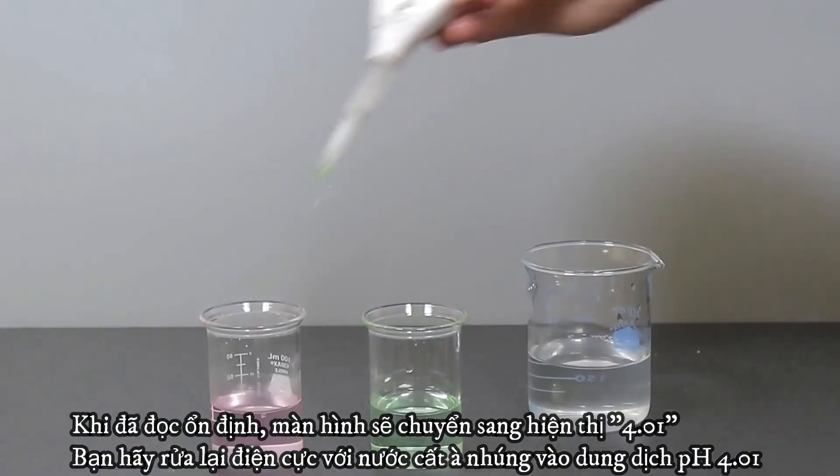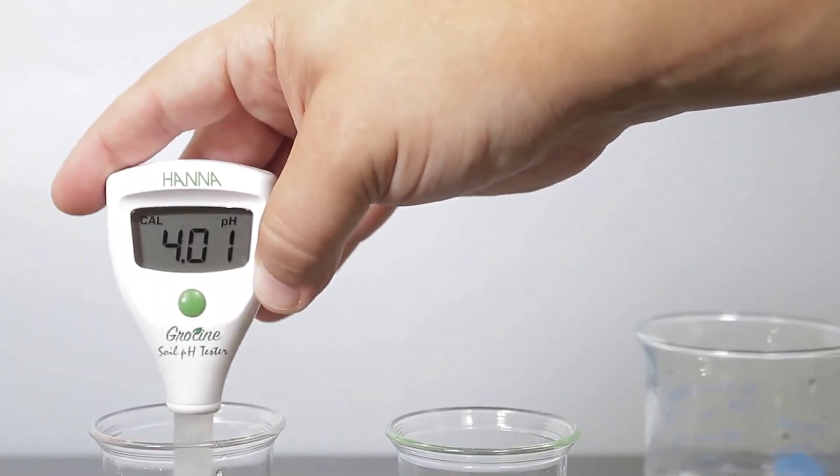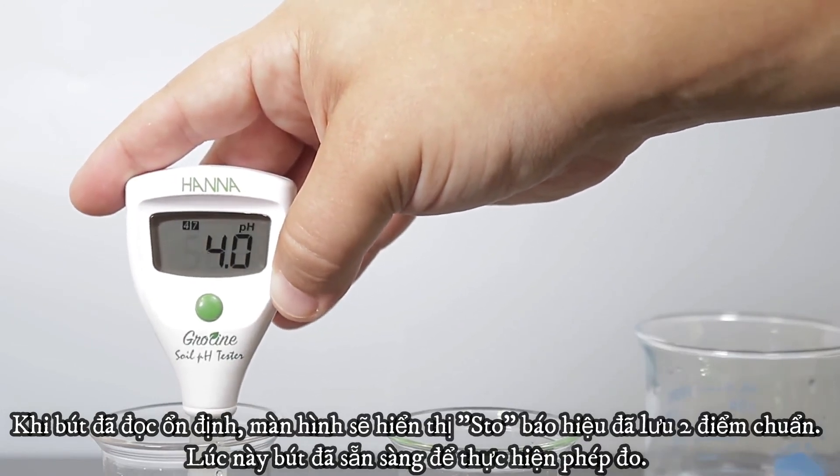Rinse the electrode again and place the tester in your pH 4.01 buffer. Once the second calibration point is stable, Store will appear on the screen, confirming that the two points are recorded, and it will return to measurement mode.